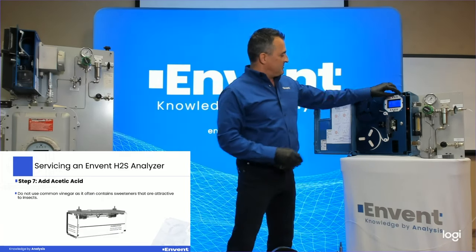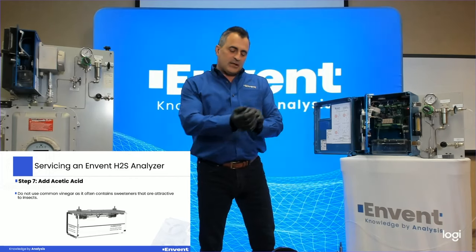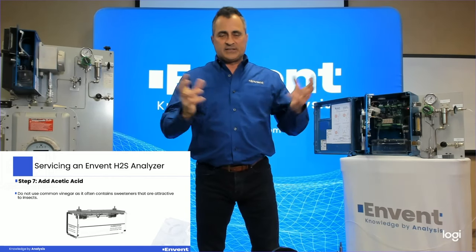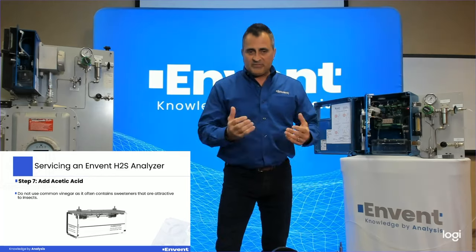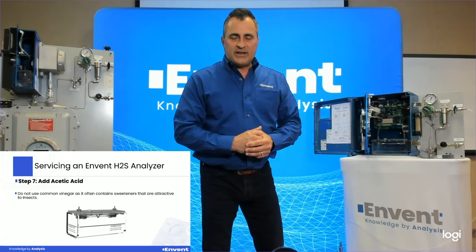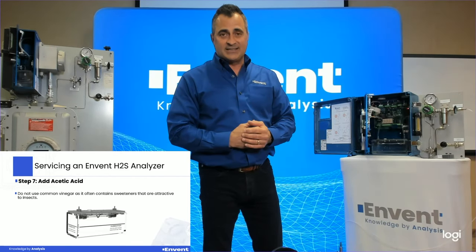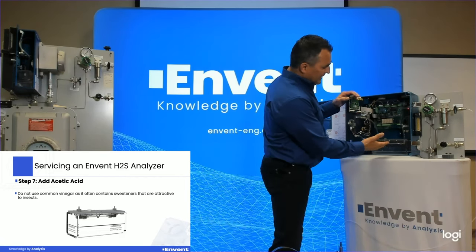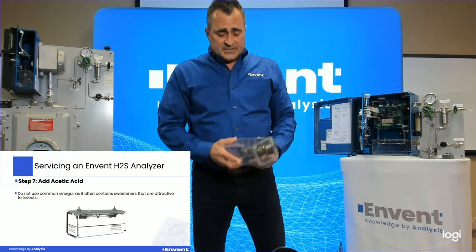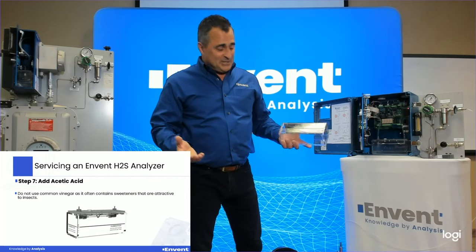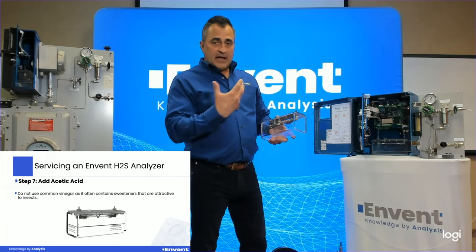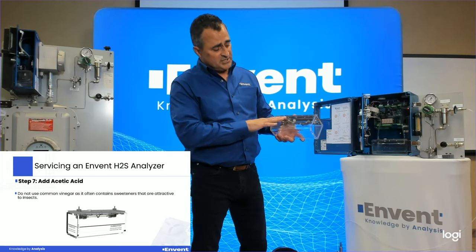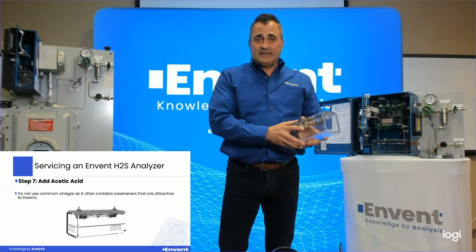The next thing we do is add acetic acid to the humidifier. We do not recommend using standard vinegar, which is 5% acetic acid — vinegar is sweetened for human consumption and that sweetener attracts insects to the device. We provide acetic acid with no sweeteners. Fill the humidifier to the line if you choose, but make sure there is some in there — it's evaporating constantly. If you're not going to visit for quite a while, you can fill above the line, but don't submerge your permeation tube or fittings in the acetic acid.